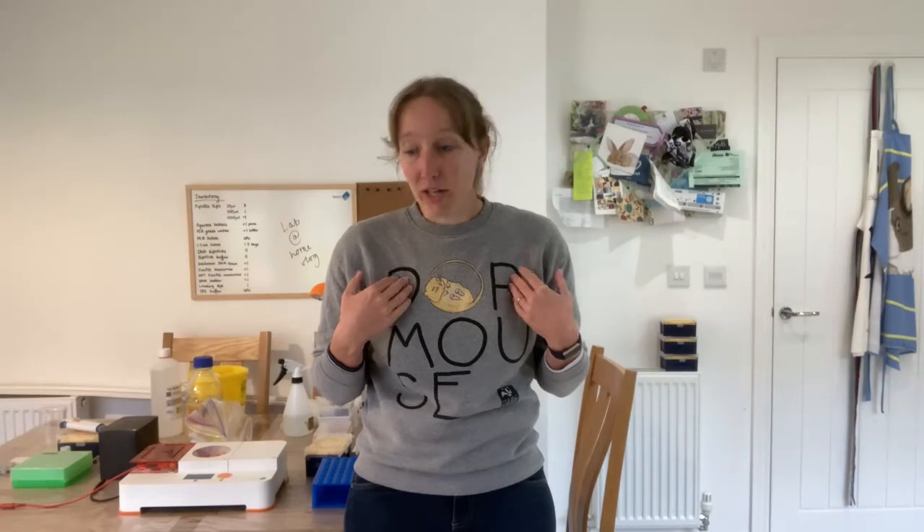The purpose of today's vlog was really to introduce you to me and to my home lab setup. Going forward, I hope this vlog series will show you what you can do with your own home lab setup, and give you a behind-the-scenes look at a day in the life of a molecular biologist. I'm hoping that I can inspire you that molecular biology really can be done from home by anyone.